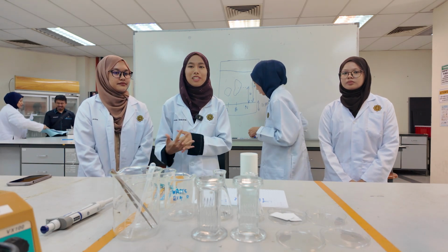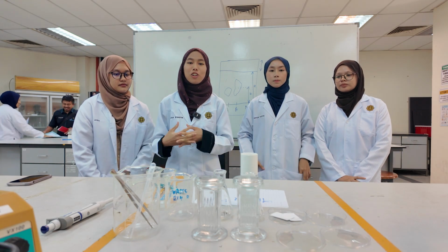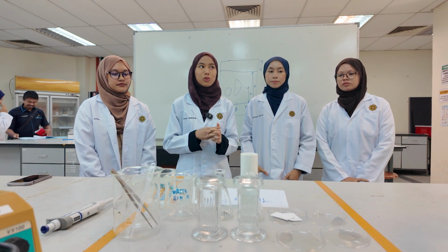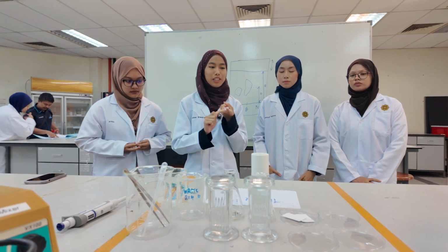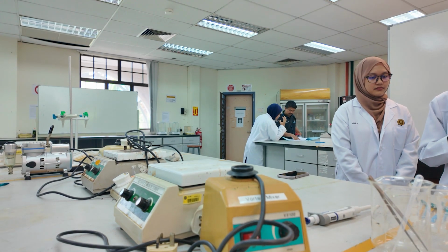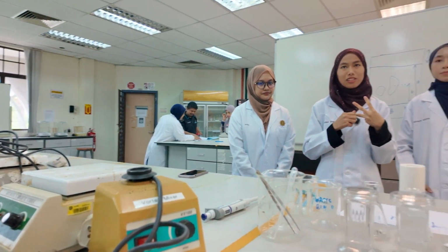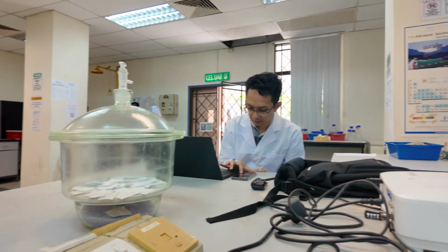You might be wondering why TLC is important, right? TLC is very common in industry to check the purity of a sample, to identify unknown compounds, and also to monitor the progress of a chemical reaction. So how does TLC work?